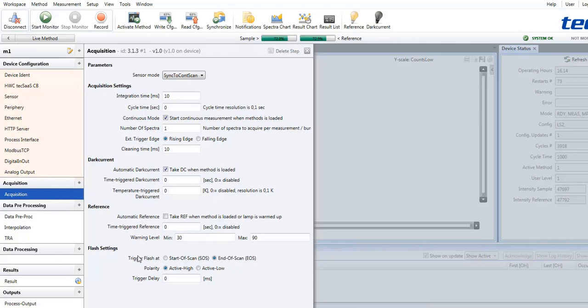There are similar settings for the reference which also allow to acquire reference spectra autonomously by the system. And, if applicable, settings for a flashlight source can be changed here. All these settings may be accepted or modified.